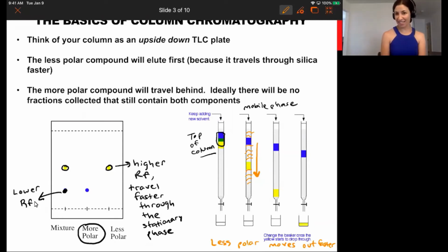on TLC data. So this will be important because as part of today's experiment, you're going to be obtaining TLC data on the components of the analgesic pill you're interested in first. And you're going to use that data to inform you as to which one will come off of your column first and what solvent to use as the mobile phase for your column to give this nice separation.